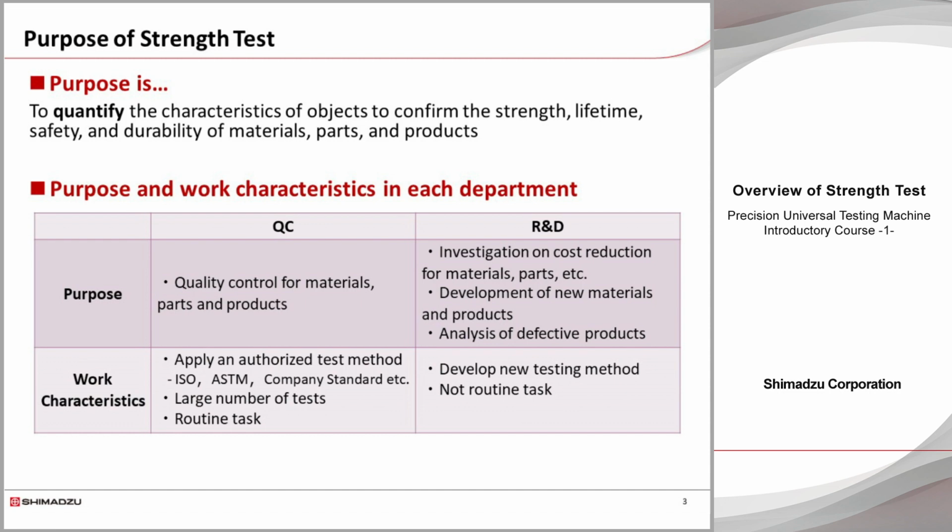The R&D department conducts strength tests to investigate cost reduction of materials and parts and to develop new materials. Unlike the Quality Control Department, this department sometimes develops its own test methods and performs a variety of tests rather than routine analysis.